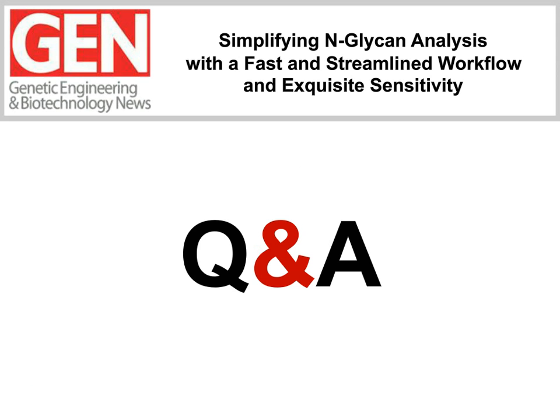Okay, well, thank you for that. Now, let's look at some of these questions that come in from the audience. The first one: does RapiFluor have equivalent labeling efficiency for most kinds of N-glycans?